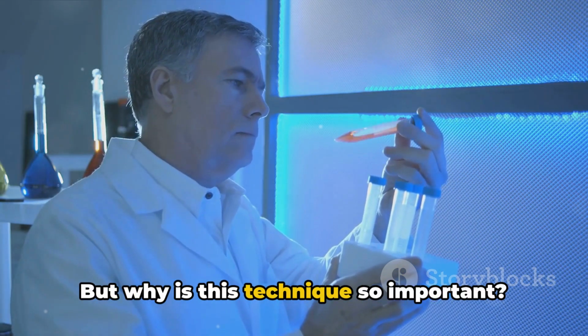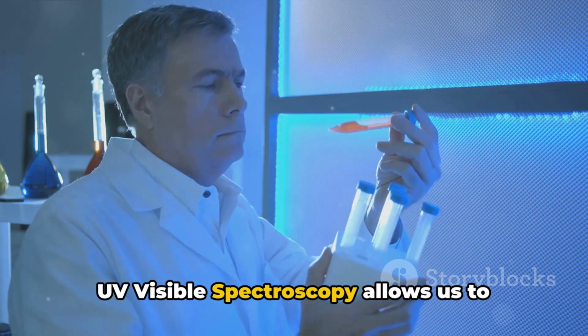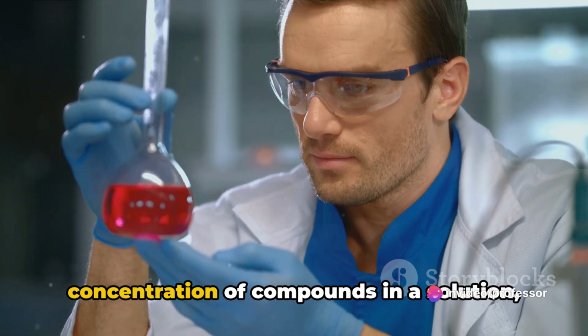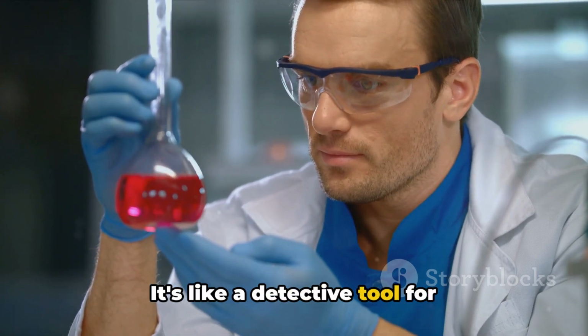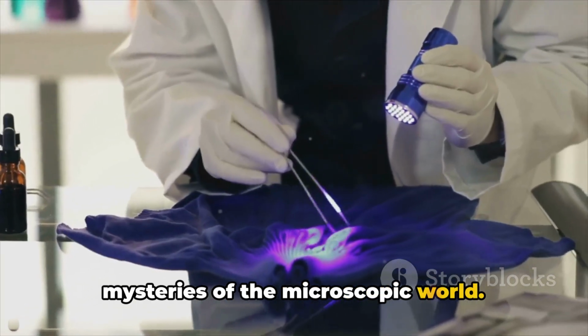But why is this technique so important? It's simple. UV visible spectroscopy allows us to identify unknown substances, determine the concentration of compounds in a solution, and even examine the structural aspects of molecules. It's like a detective tool for scientists, helping them unravel the mysteries of the microscopic world.